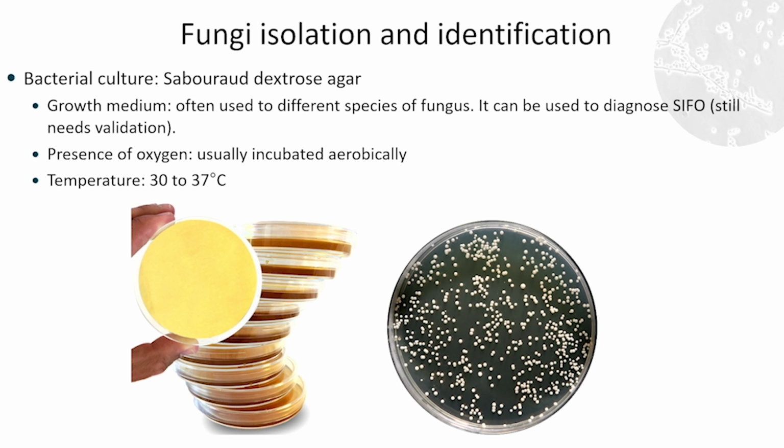These agars are very unique because they have components that inhibit the growth of bacteria, and only fungi can grow in it, right? We develop these components that can inhibit cocci and bacilli, although in some cases these bacteria can overcome these inhibitors, but there are a few exceptions.